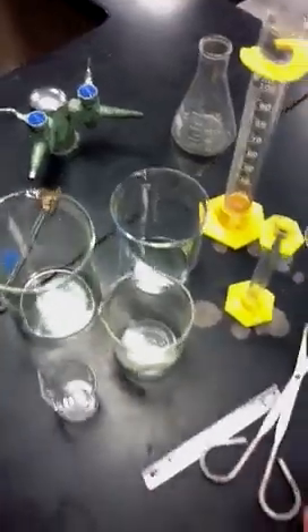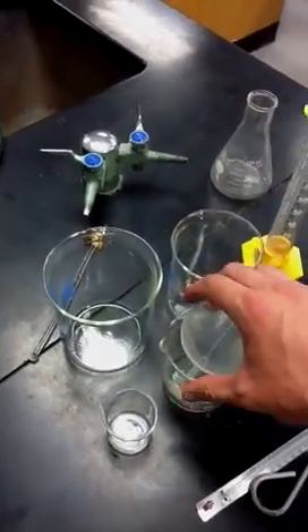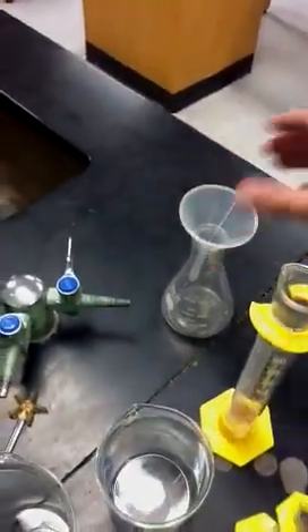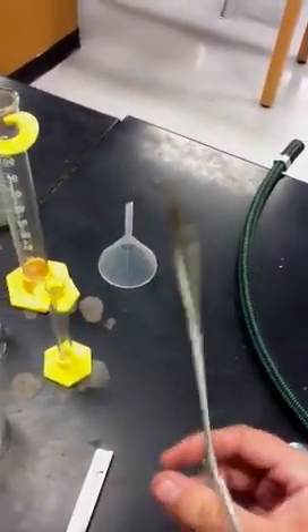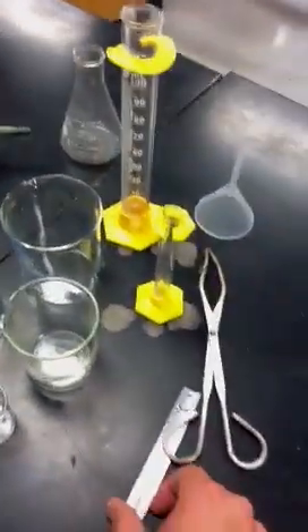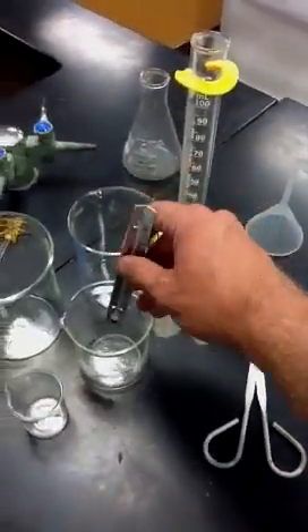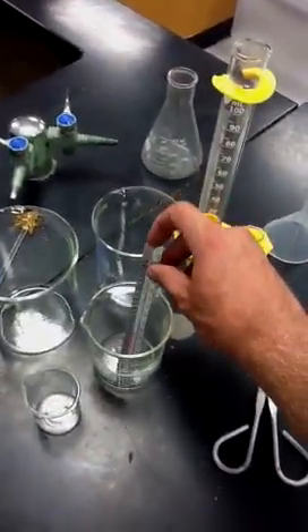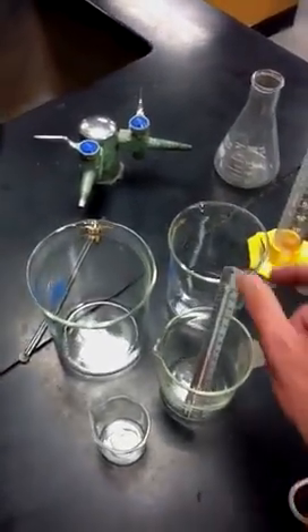We also have things that go along with these measuring devices. We have this funnel that can be used to put inside something to pour in — if you want to pour chemicals in and not spill, you can use a funnel. We also have these things called tongs, which can be used to pick up hot things. We have this thermometer, which can be stuck in a beaker to read the temperature. We also have digital thermometers as well, but I don't have them to show.